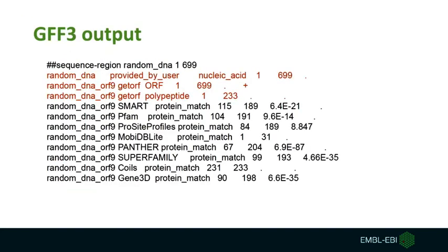The next output for sequences that is useful is the GFF3 output. And here, if you're familiar with GFF3, it provides terms.